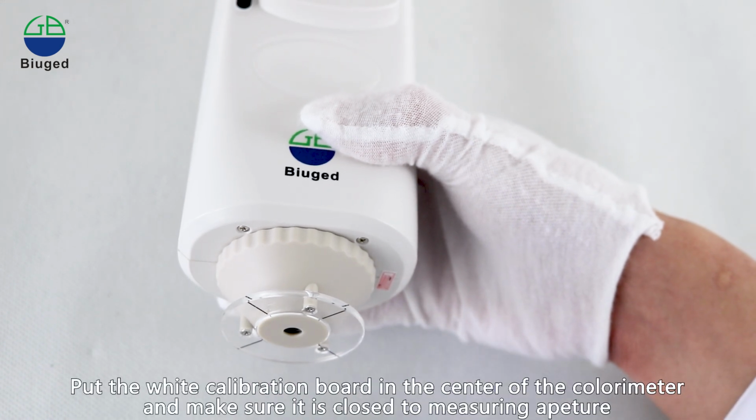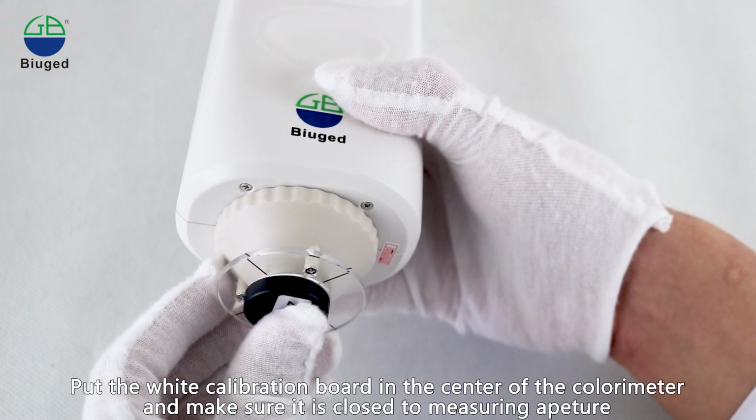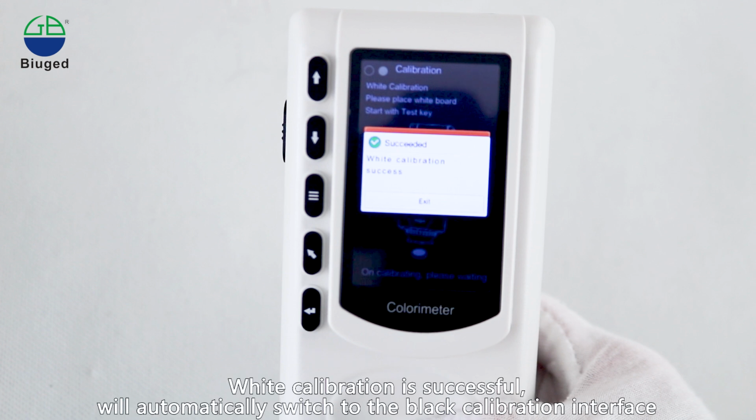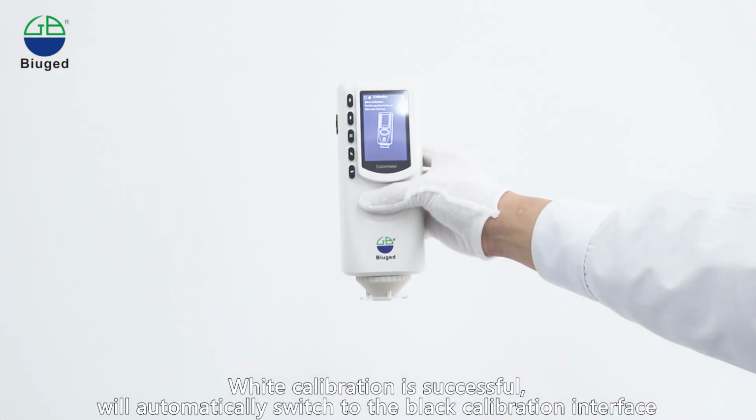Put the white calibration board in the center of the colorimeter and make sure it is close to the measuring aperture. Press the testing key again to perform white calibration. White calibration is successful. It will automatically switch to the black calibration interface.